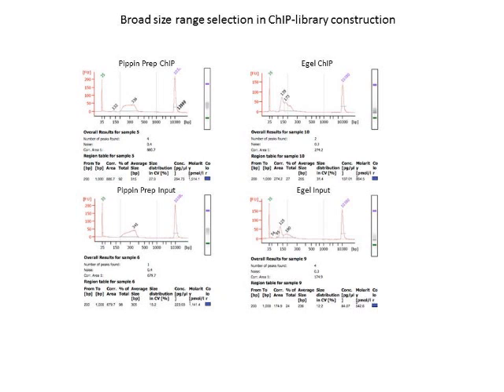And on the eGel side, this would not have ended up going on a sequencer because I wasn't able to resolve the primer-dimer pair, and even if I had done that, the enrichment of the material would have been so low that it would not have been a good run on the HiSeq 2000. And this is also confirmed when I do qPCR with primers to negative and, oh sorry, I'm skipping ahead a slide. So these are parallel samples to this one, on which I performed both post-ligation size selection and post-PCR size selection. Doing Pippin prep on those, I did not have comparable samples on the eGel.